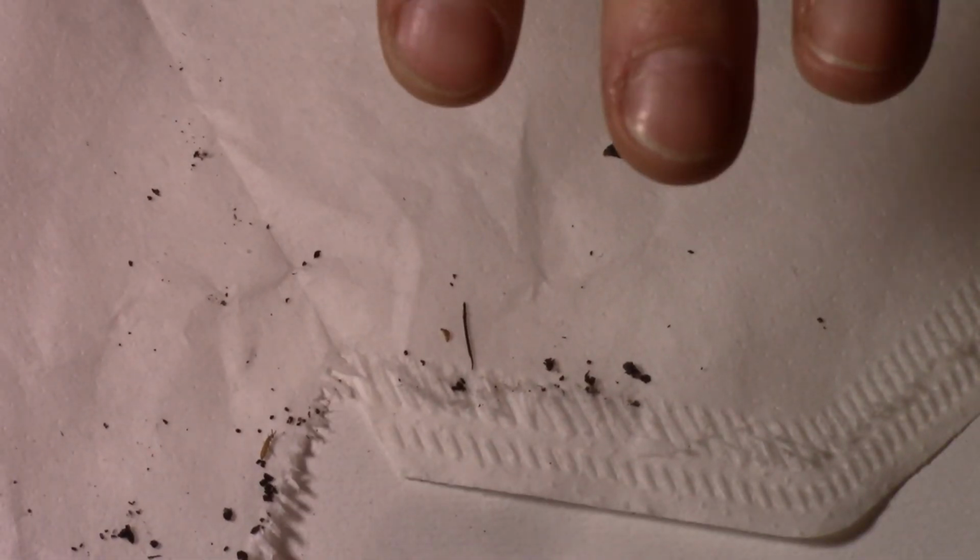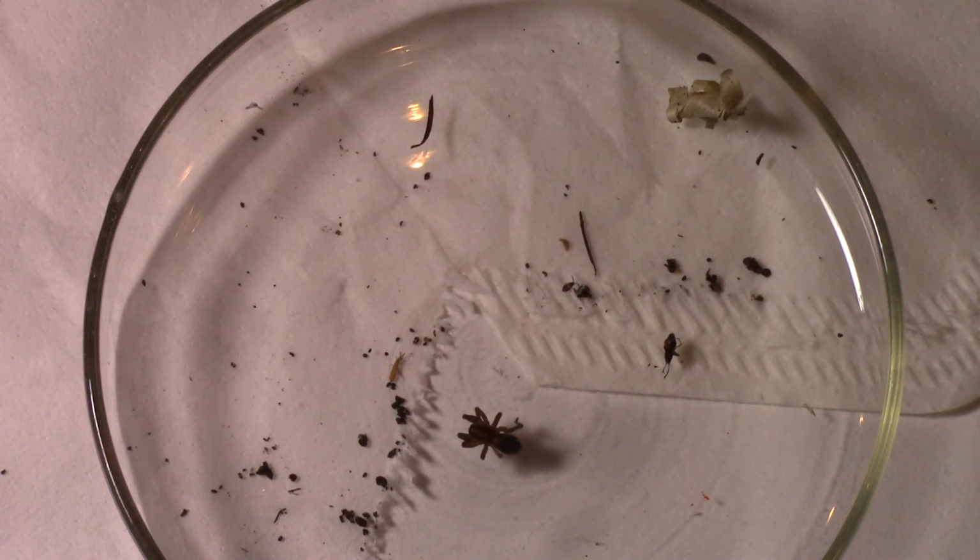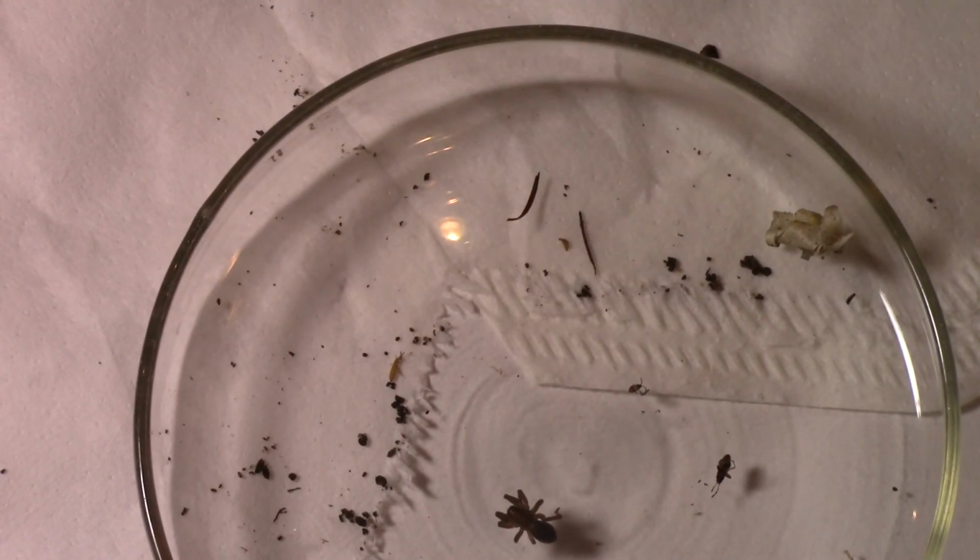And yeah, I am curious to know what you find. Whether you find anything in your Berlese-Tullgren funnel, like if everything is so small your microscope doesn't pick it up, you can still use the things that are in your hand sorting. We can combine this data. You can use just your hand sorting or just your Berlese-Tullgren sorting. You can write your report on whatever data you find. So don't think that if your microscope's not good enough, you're not going to be able to do this assignment.